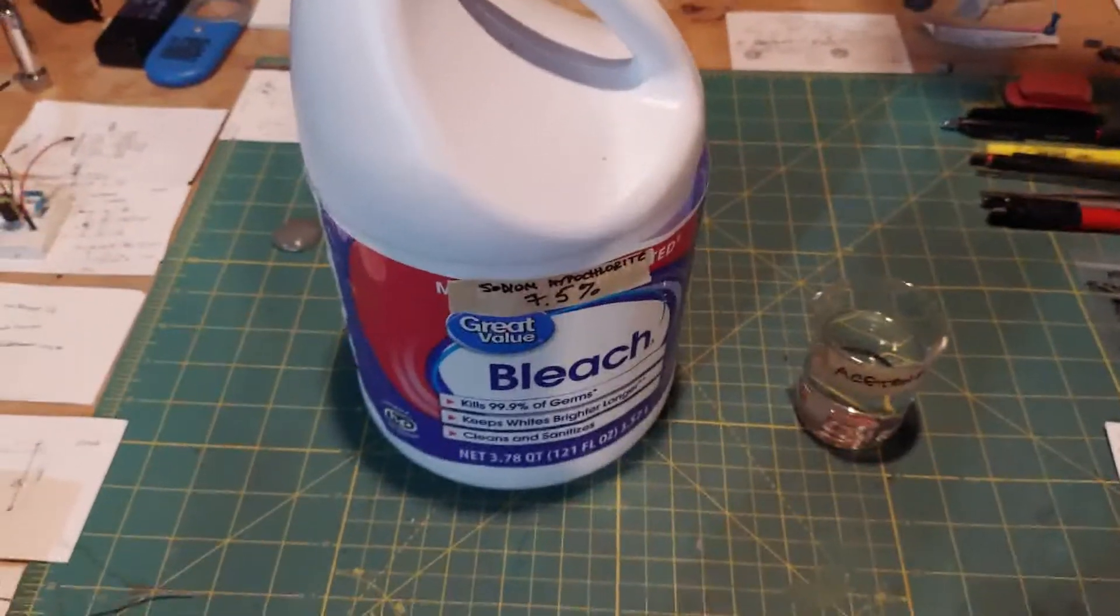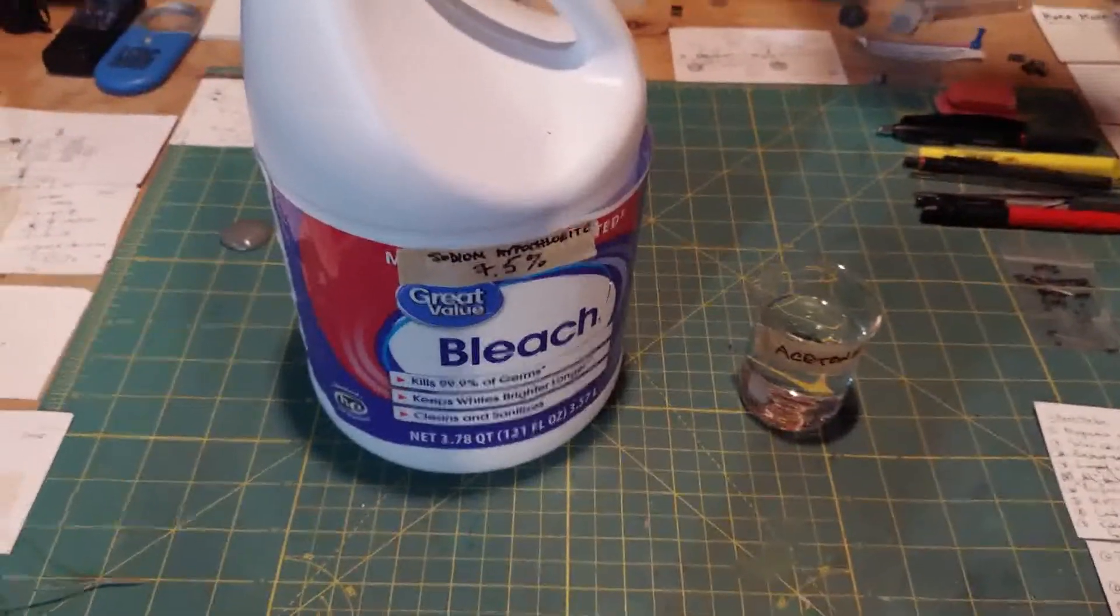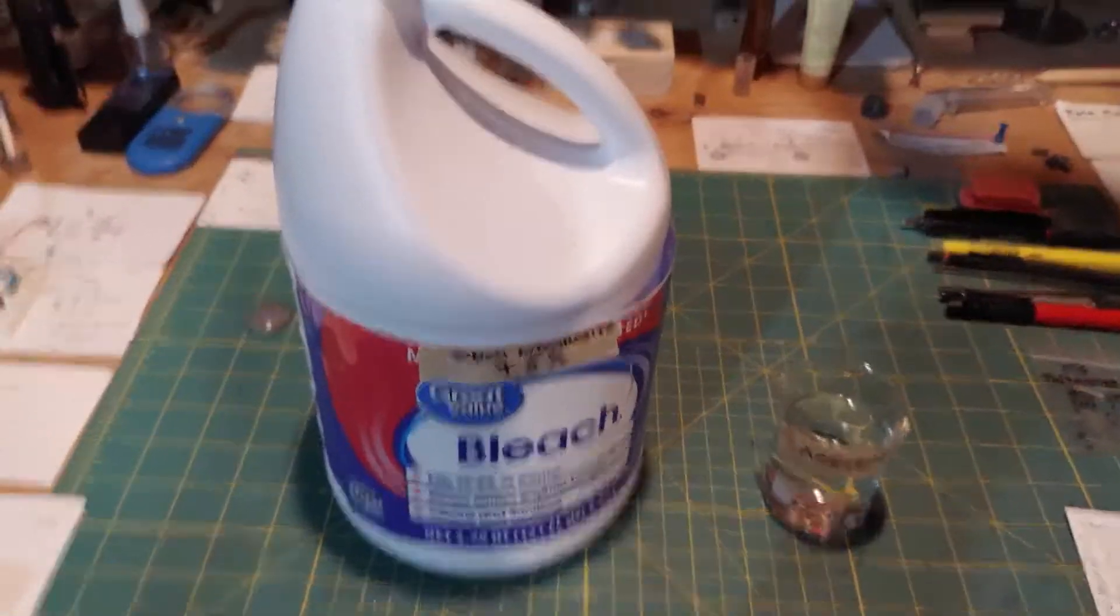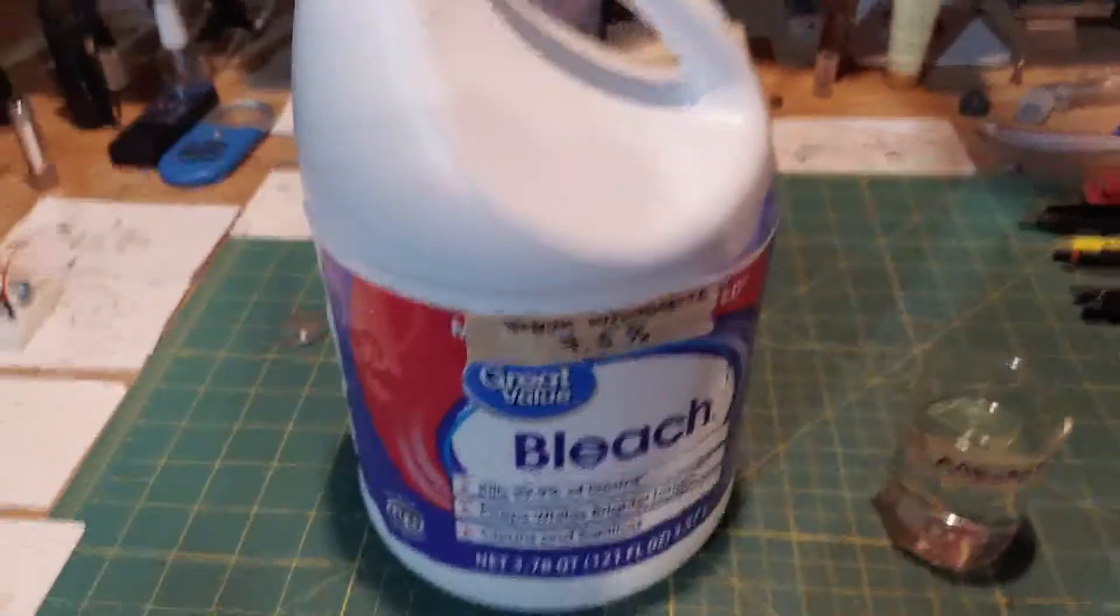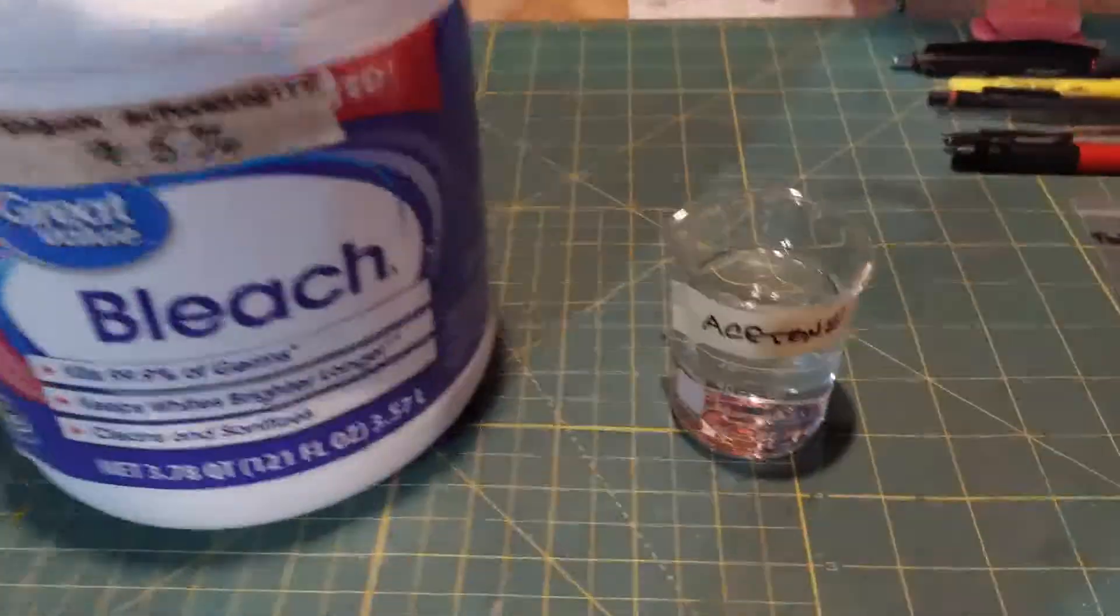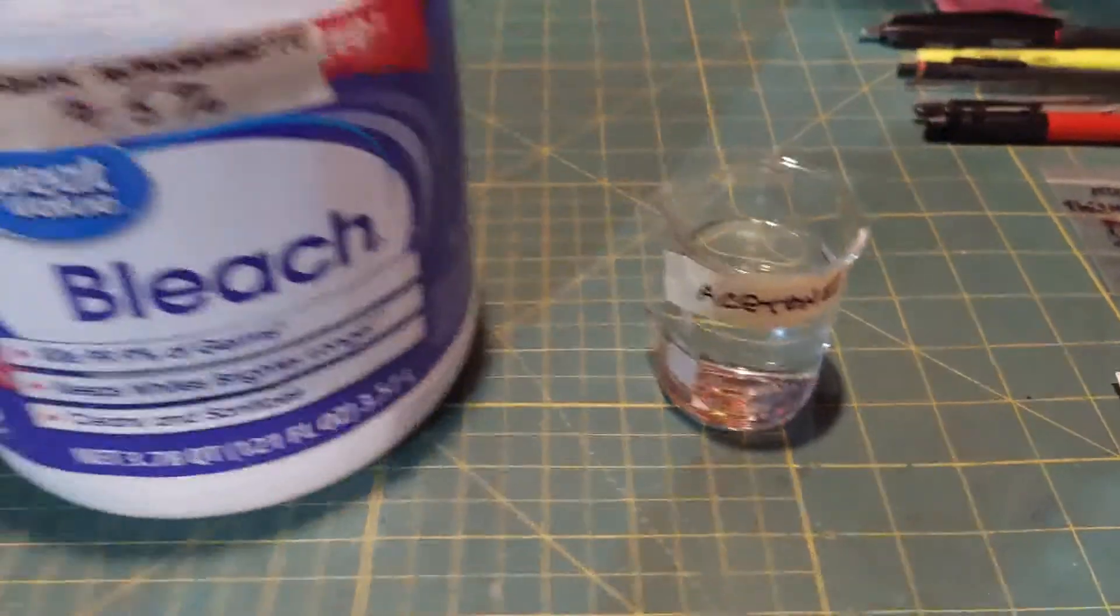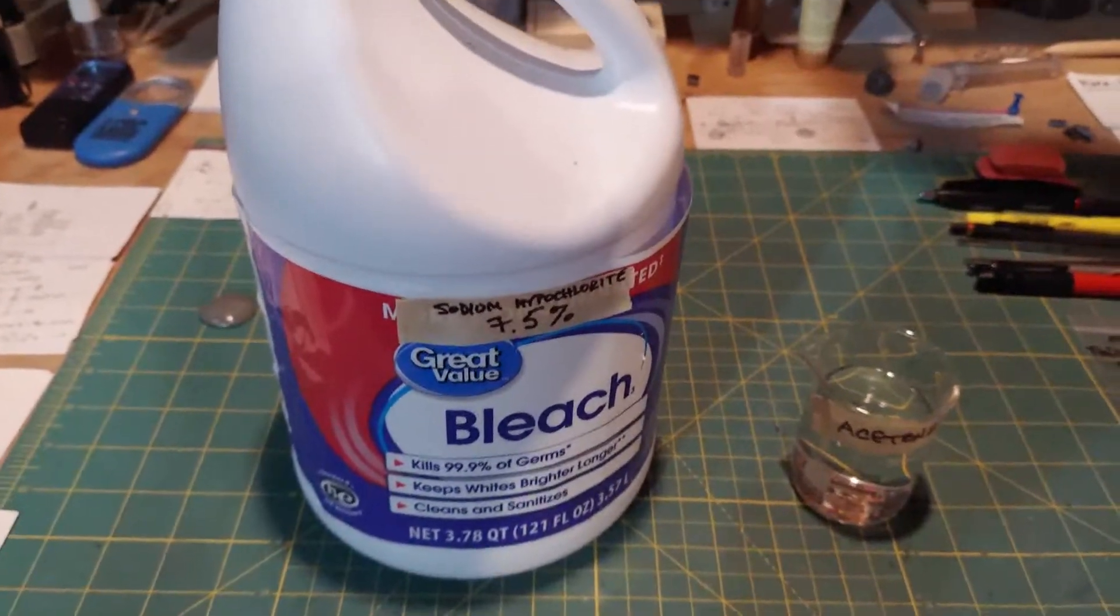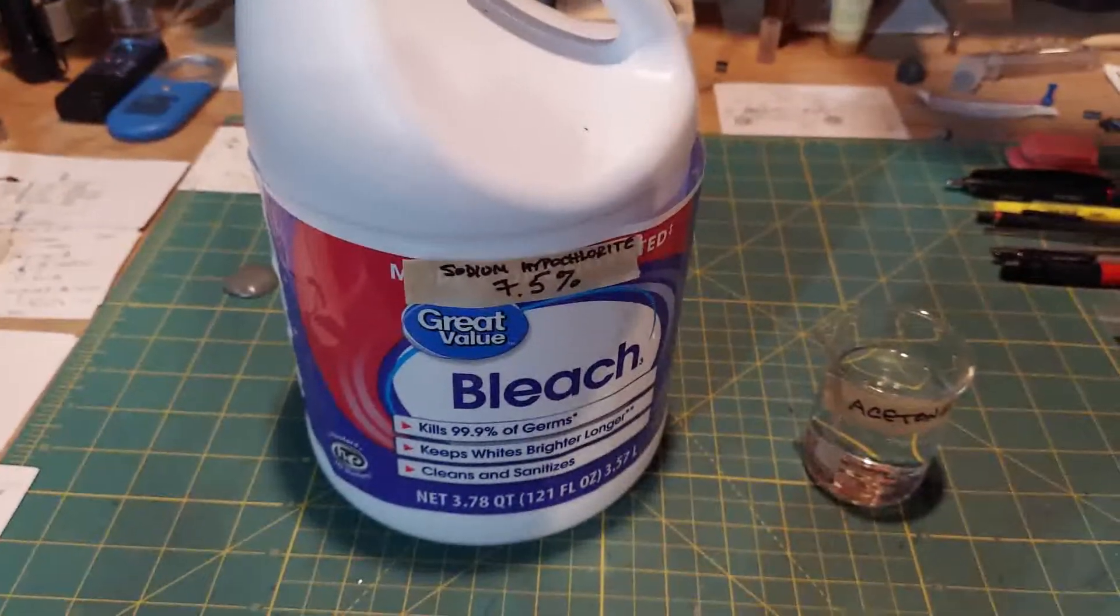Okay, we're about to make chloroform. Yep, the same stuff that they used to use, sometimes even on movies, to put people to sleep. And all you need is bleach - you can see Great Value, so that came from Walmart - and acetone. You can get acetone almost anywhere, like nail polish remover. A lot of that's just acetone.